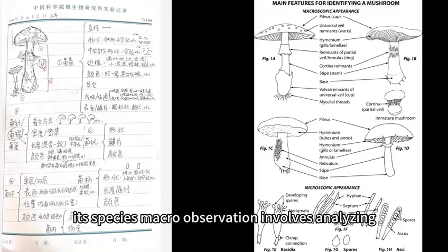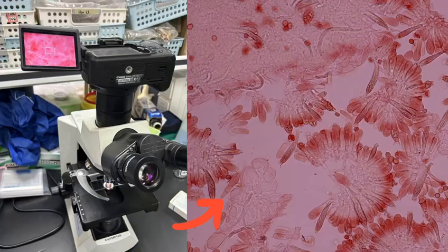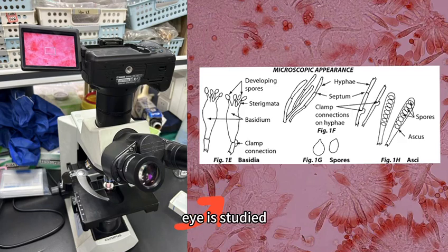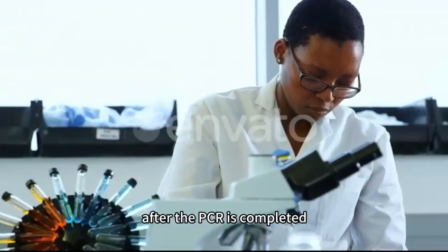Macro observation involves analyzing physical characteristics of the mushroom on the whole, while micro observation is conducted under the microscope as features invisible to the naked eye are studied. Finally, phylogenetics is applied after the PCR is completed.